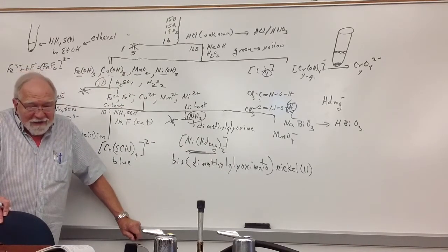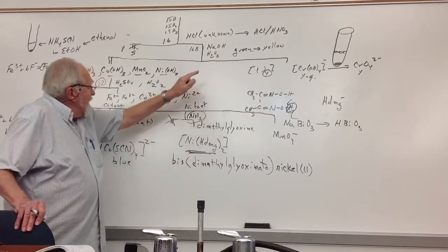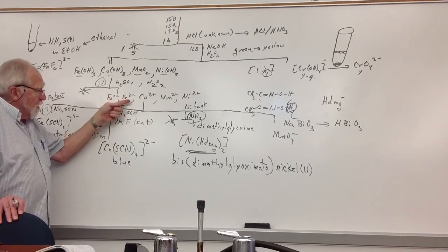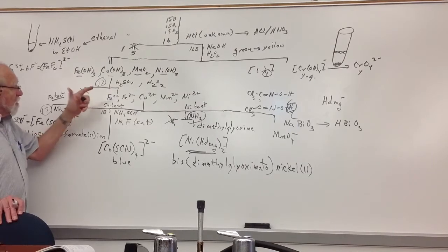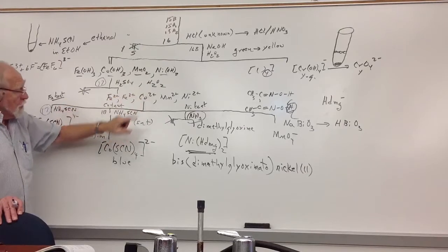So the trick is to add just the right amount. Here you're using the color to decide. Here you're adding a drop. If precipitate dissolves, you add another drop. When the precipitate doesn't dissolve, you separate it, test it again by itself. If it doesn't dissolve, you haven't added much extra hydrogen peroxide, and then you just boil again.